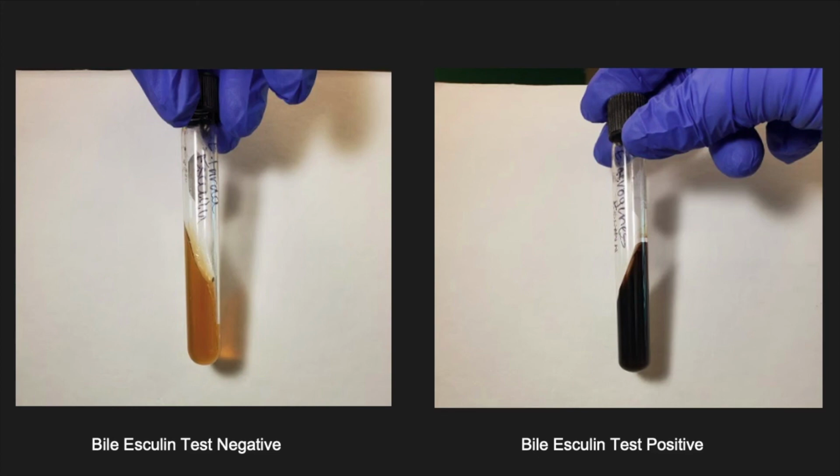Because we mentioned how when we have esculin being hydrolyzed to esculetin and these ferric iron ions come into play, we have a black product formed. And that's what that is indicating. The black product formed, meaning esculin was hydrolyzed to esculetin, and ferric ions played a role in changing the color.